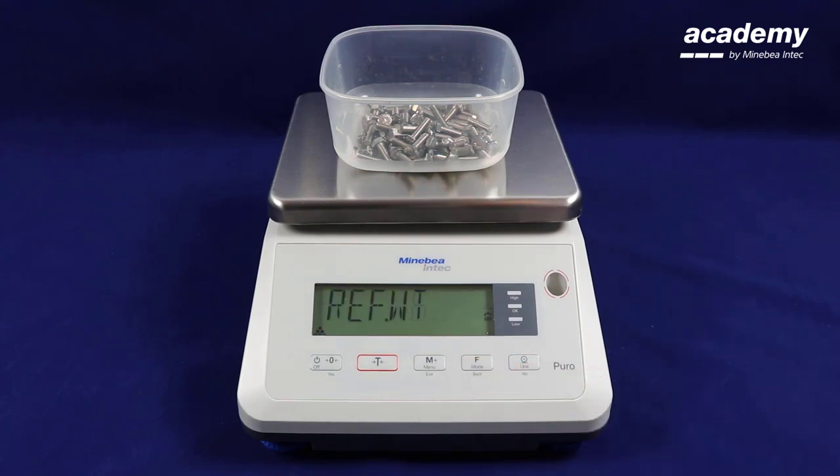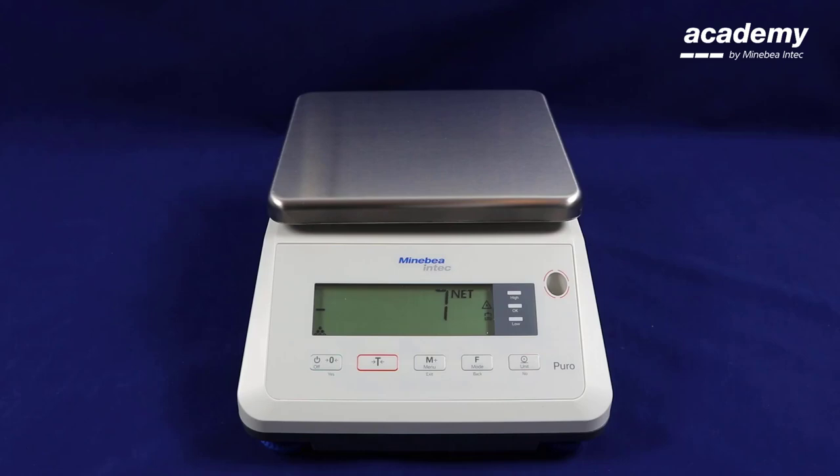If you press the function key or mode key, it will show you the reference weight and how much each part weighs. We remove the sample and we have a minus value, as it has taken into account the tare.